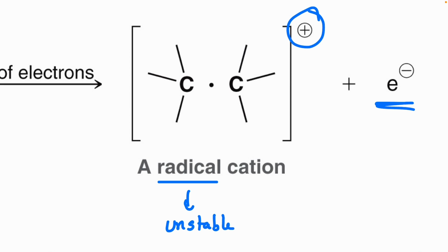It's furious. All right? Maybe it survives all the way to the detector, but there is a large population that is going to just start breaking apart. It's just all sorts of mad. It just starts collapsing. All right? And so that's why we get our big peak at the very end of our spectrum corresponding to the whole intact molecule, but we also get a bunch of little fragments as well.